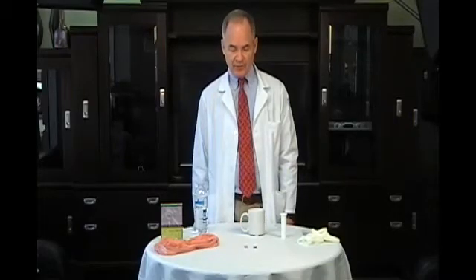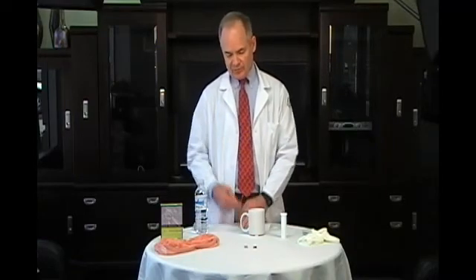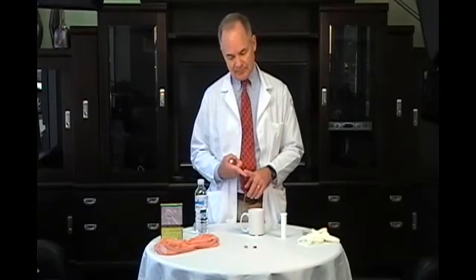Now you're supposed to wait for 10 minutes officially, take it out, place it on a dry surface, wait 10 more minutes before reading it. If you see 2 red lines, it's a positive test. If you see 1 red line, it's a negative test.